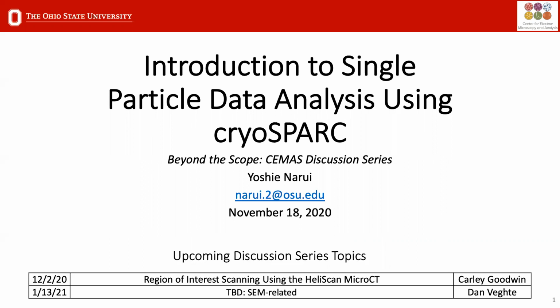Today, we have Yoshie Narui giving a talk in the cryo electron microscopy field, about understanding how to do some single particle analysis with the CryoSPARC software. I'm excited to hear a little bit about some of the technology that's going on there.